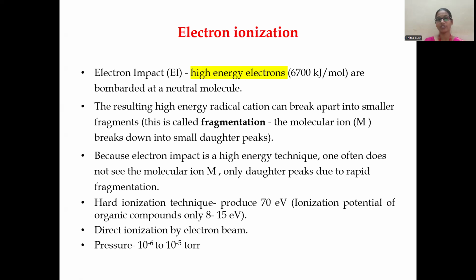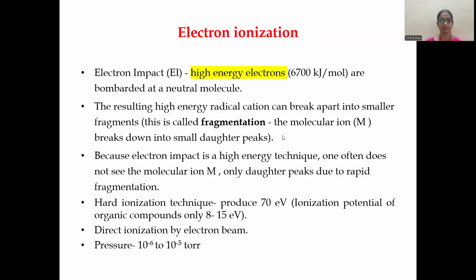The compound's vapors will be coming inside, and because of these high energy electrons, the vapor that is coming in will be converted into smaller fragments.